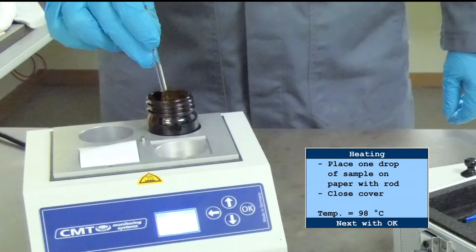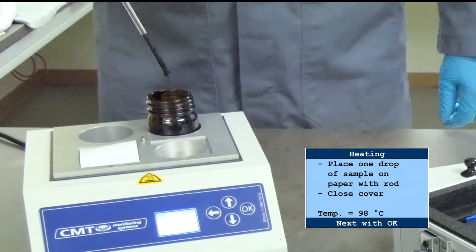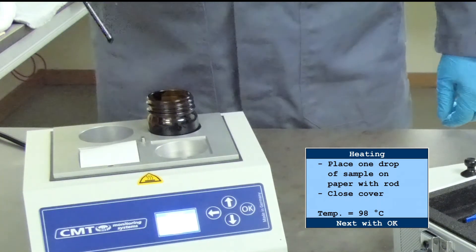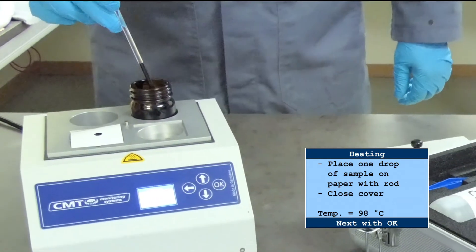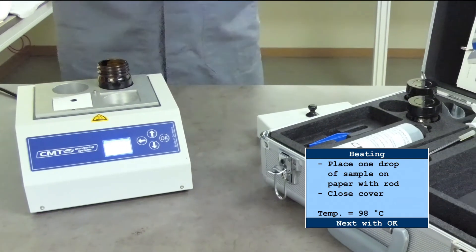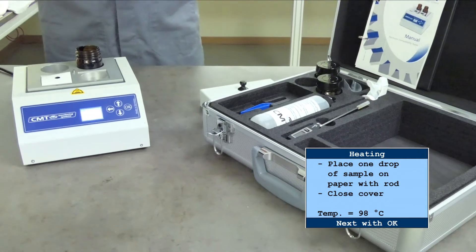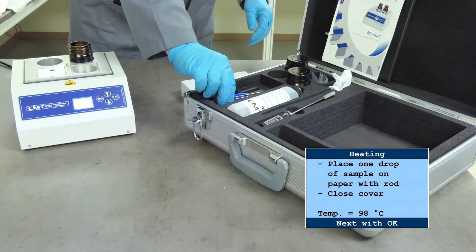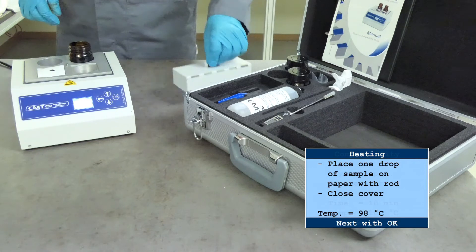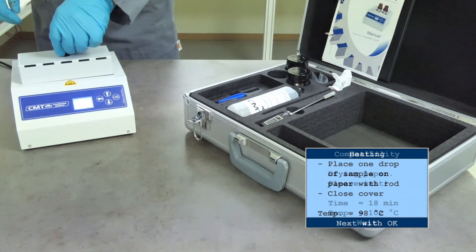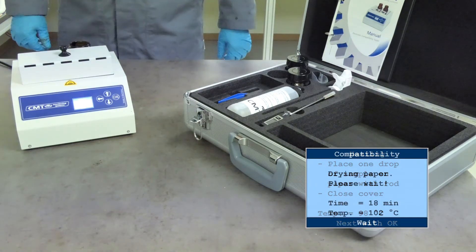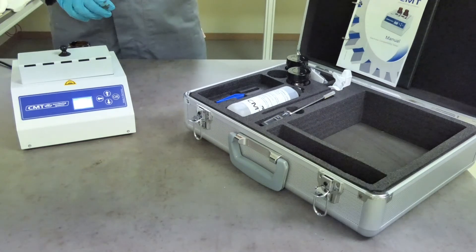Withdraw the rod and allow one drop to fall back into the glass bottle. Drop the next one in the center of the sheet of test paper on the heating plate. Close the cover over the heating plate and press OK. Allow the test paper to dry for one hour. The counter on the display will show the time left.